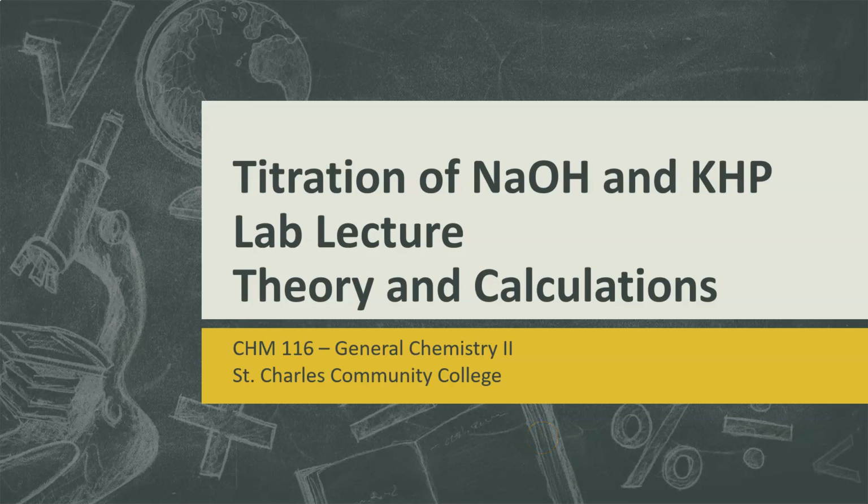This is the Theory and Calculations lab lecture video for the titration of sodium hydroxide and KHP, potassium hydrogen phthalate. So first, let's talk about the background of the titration, which is a type of procedure. It's a skill that we learn.